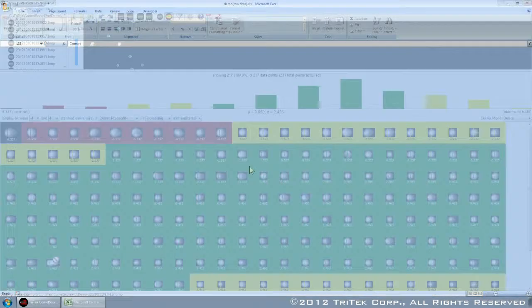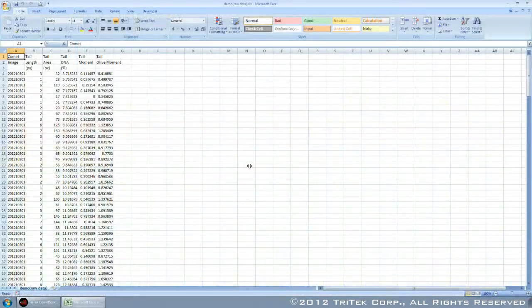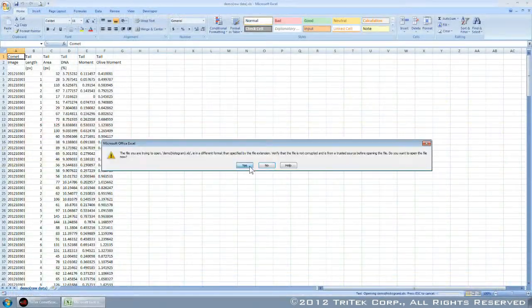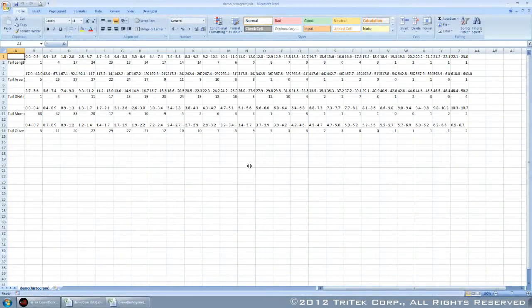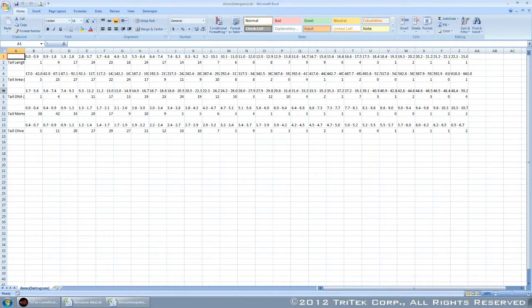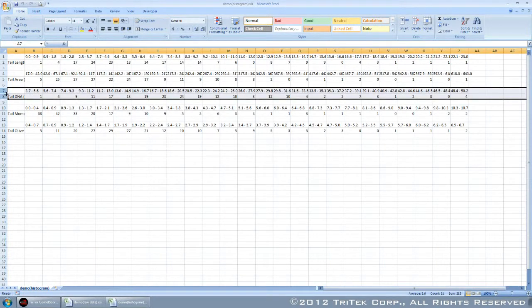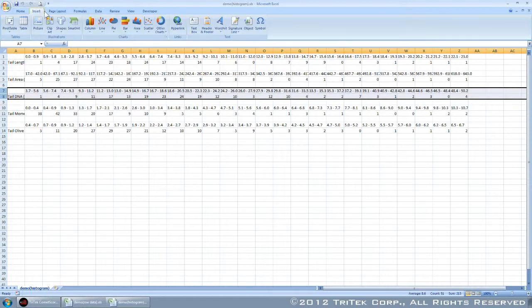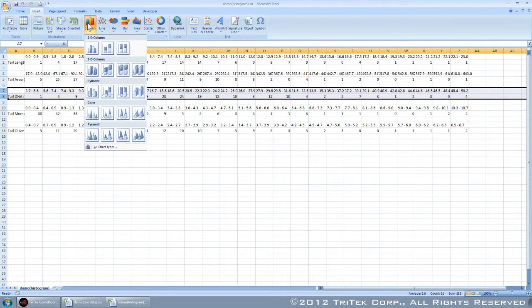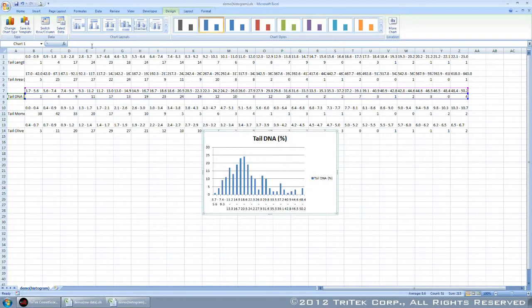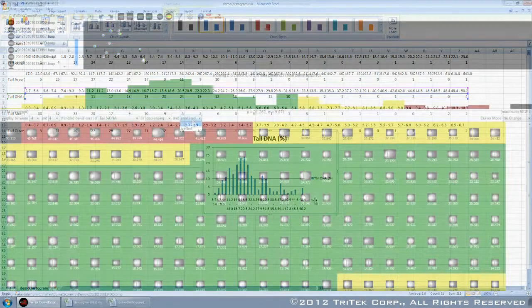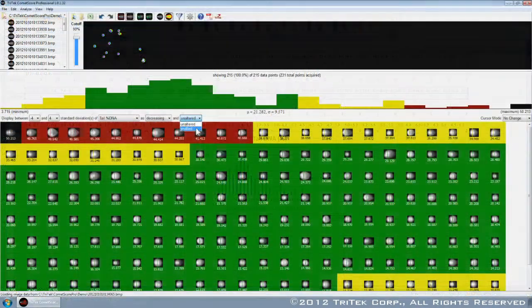Once you're ready to display your results, both the raw data and the histogram data can be easily exported into an industry-standard spreadsheet format. The end result is an efficient, accurate, and comprehensive comet assay report.